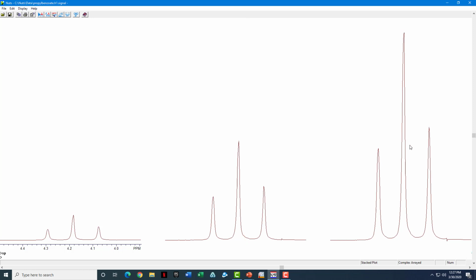And finally, doing 9 times the number of scans on the right here, we would expect 9 times the signal, and that would come out to around 45 or so. We'll put the mouse up here. Comes out to 42.2. So it comes out a little bit less than what we'd expected, but it scales pretty well with the number of scans.